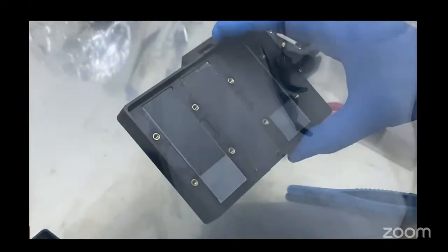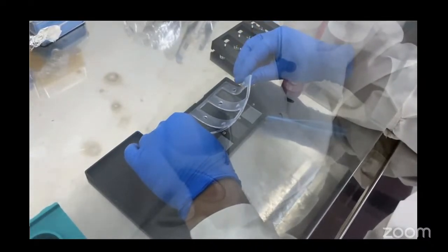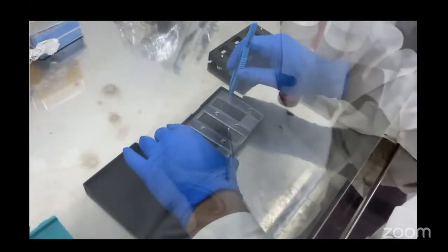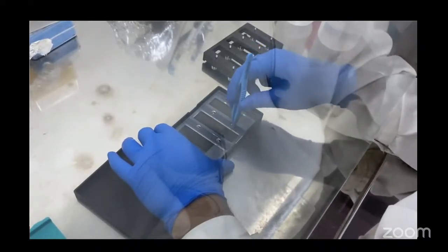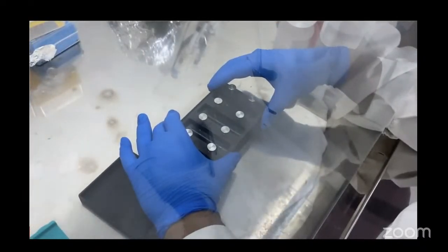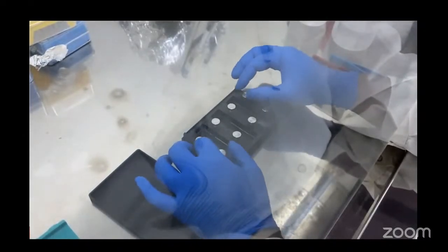Now, allow the gasket to be placed over the slides. Remember to keep the glossy side of the gasket on the downward side. Align the silicon gasket over the slide and tightly seal the incubation chamber using the screws. Remember, tighten the screws only diagonally. This will ensure that the slides do not break.